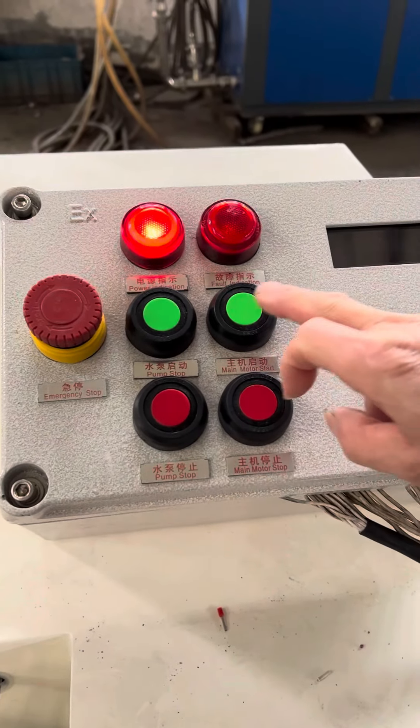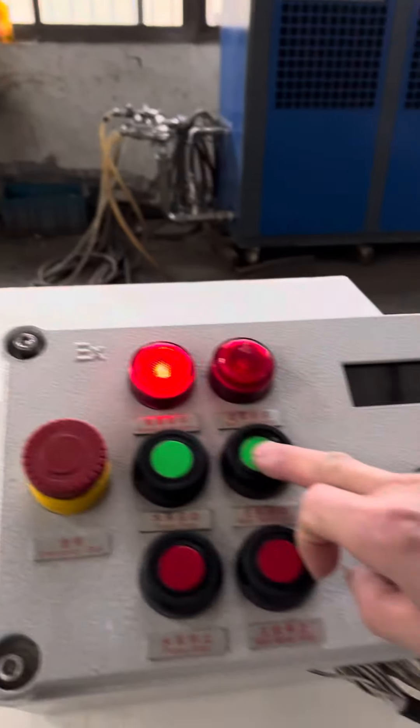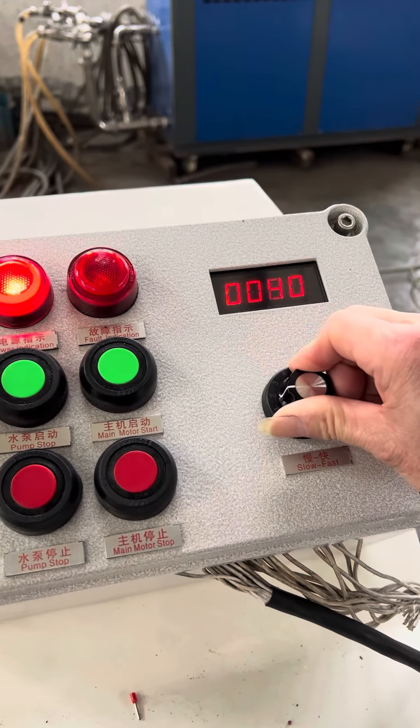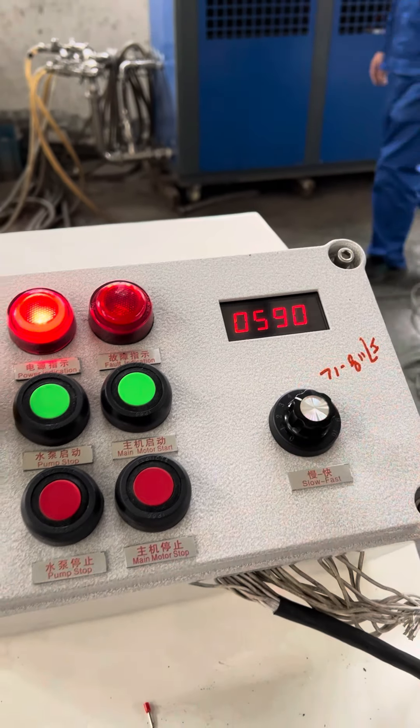Pump start. Check the flow of the cooling tank. Motor start and adjust the speed to around 600 RPM.